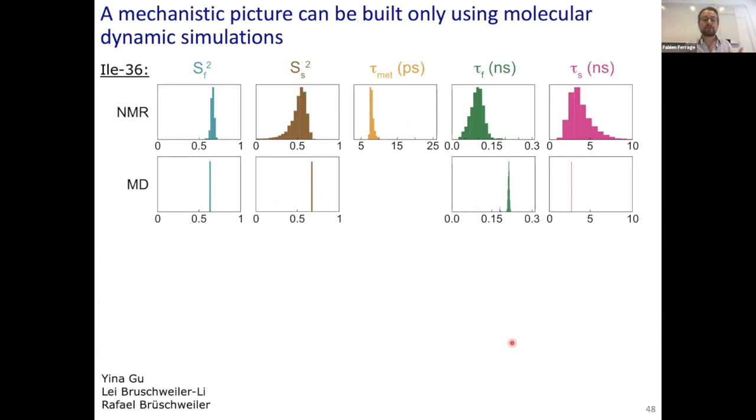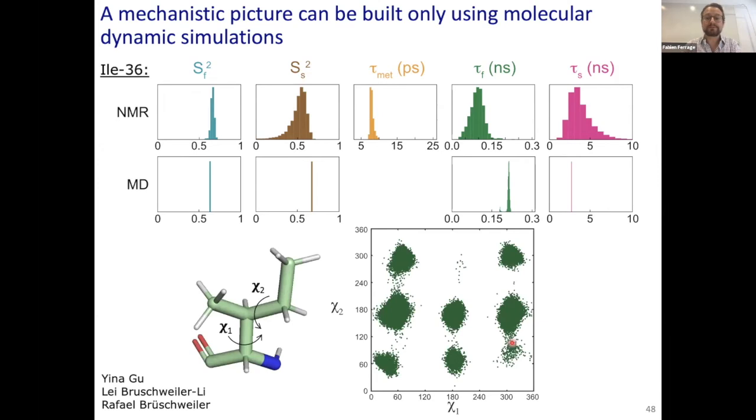So what we decided to do is to team up with Raphael Buchweiler and his team and analyze the molecular dynamics trajectory, and decide in a very simple, first zero order approach that if there was a good agreement between the parameters of the MD trajectory and relaxation, which happens sometimes but not all the time, then we could look at the MD trajectory, consider it was validated by relaxation, and describe what was the type of motions that we were seeing.